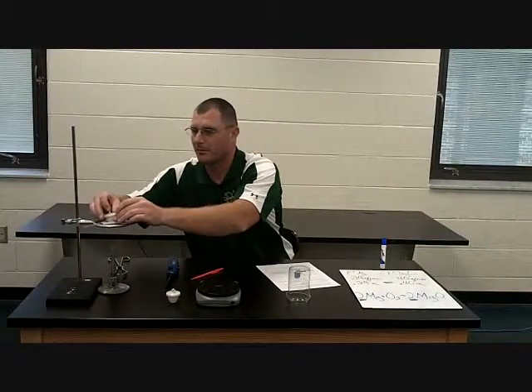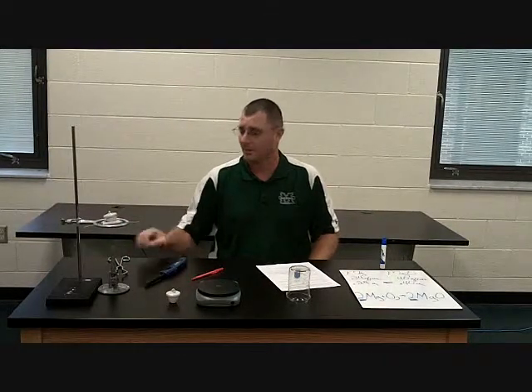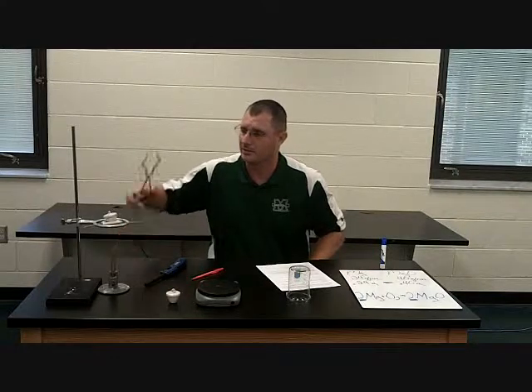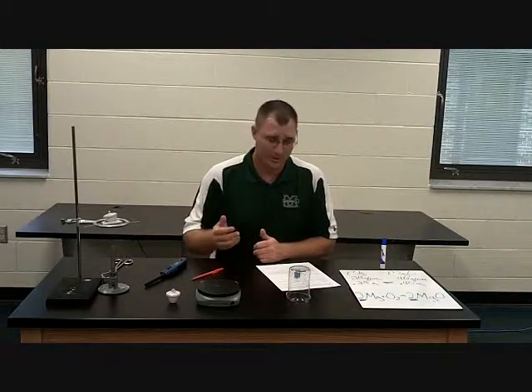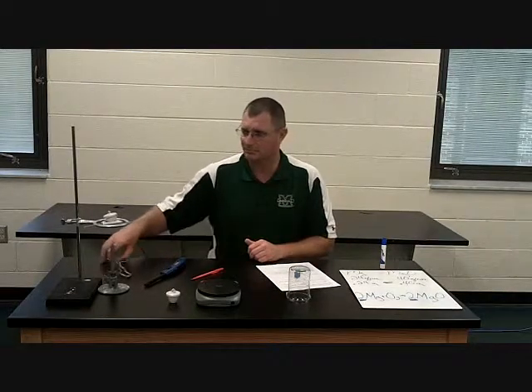After I do that, and I've got my lid cracked, I'm going to light my Bunsen, and I'm going to let that heat for 10 minutes. Okay? And I can take my tongs and check periodically to see how it's doing. I have to be careful, I don't want to lose any of the product, but what I'd like to see is it turning white. Remember that white powder we had when we burned it? I'd like to see that happening on the inside. So I'm going to let it burn for about 10 minutes.